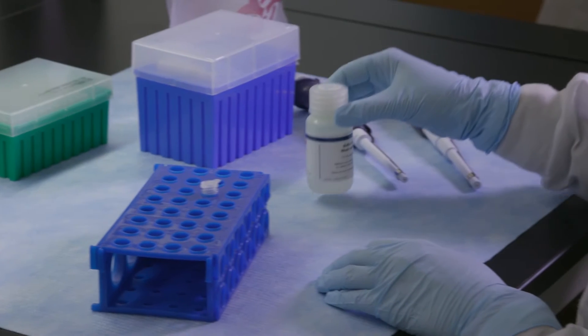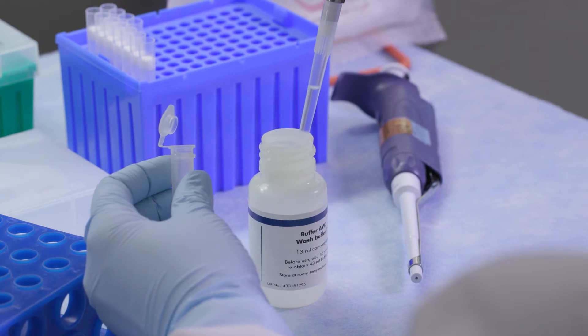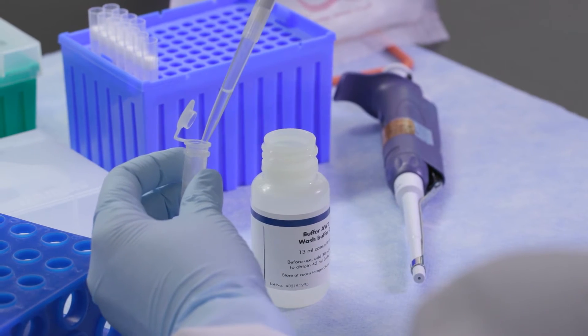Apply a wash buffer to the same column to wash out contaminants in order to improve the purity of the eluted nucleic acid.